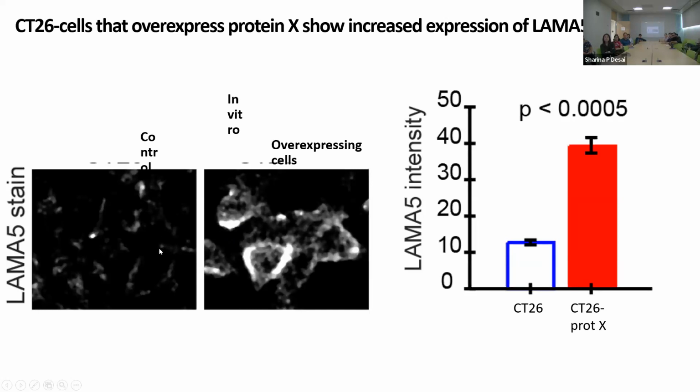Then I captured a few images, and I again used my own image analysis algorithms to quantify that. I saw a big difference. In this case, I probably don't even need the mix because I could just capture one area in the center, and it's not very heterogeneous. It's pretty much the same, so I really have faith that this works well. But if I could capture these tumor sections, the whole thing, with the Cell Omics, and the Cell Omics can do it for me without me having to manually do these tilings, that could be something I'd be very interested in. So I will check with you on that.